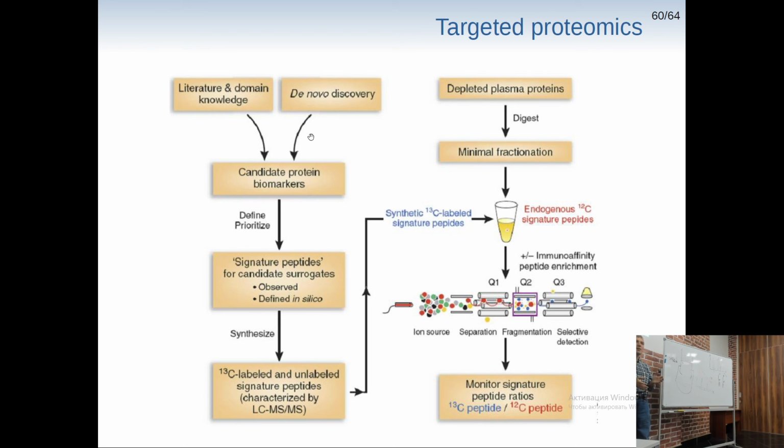It would be cheaper than asking for artificial synthesis of a peptide, and you will have your own control. You can get this peptide in known concentration and add it to the sample just before extraction, so if the real one is lost in some way, the heavy labeled one will also be lost in the same amount, and you can just compare those two peptides, right?